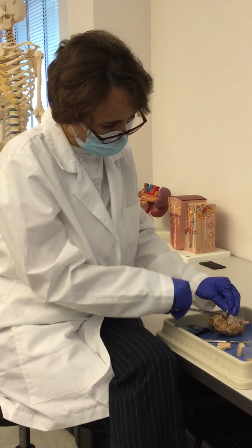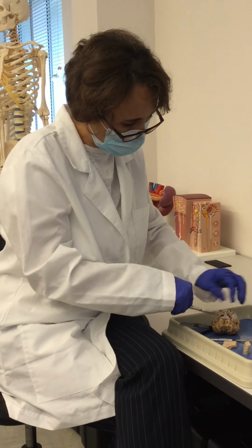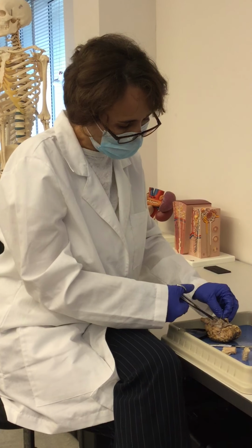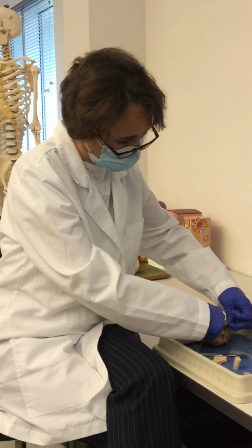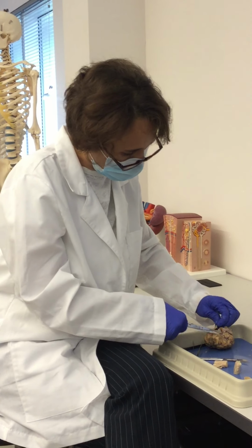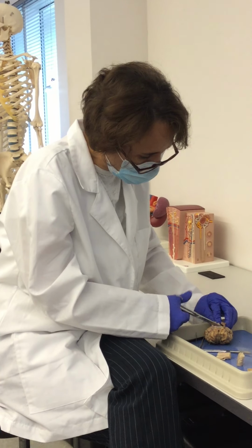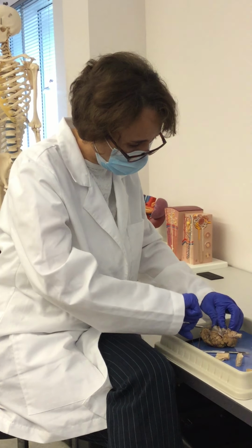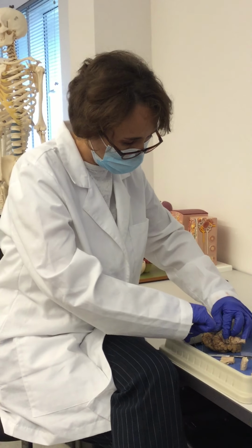So I try to preserve the optic chiasma and the pituitary gland. It's not easy because this membrane, this meninge, is so intrinsically embedded within these tissues, so it's going to take a while. So this is the hardest part of the removal of the meninges, the dura mater in this area.